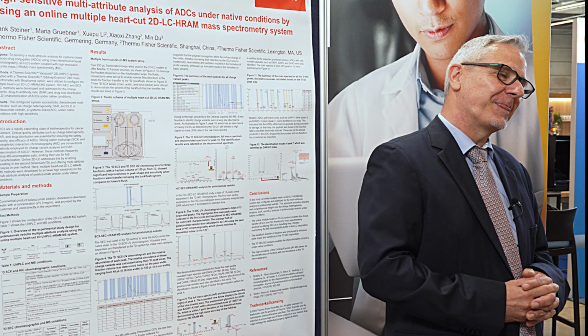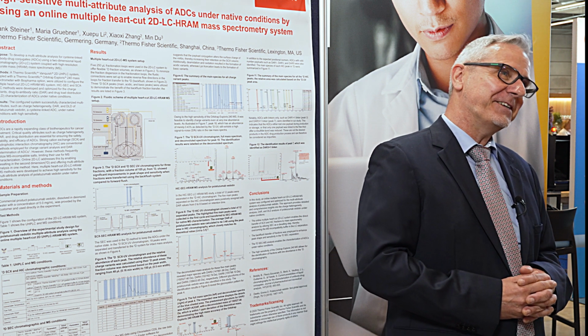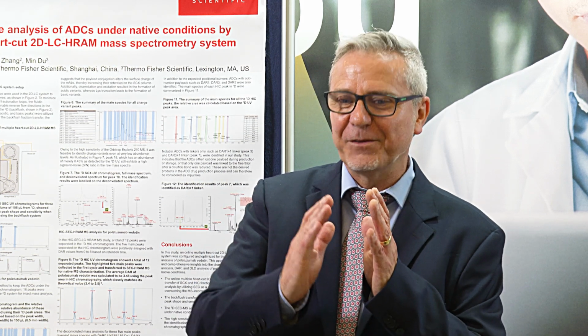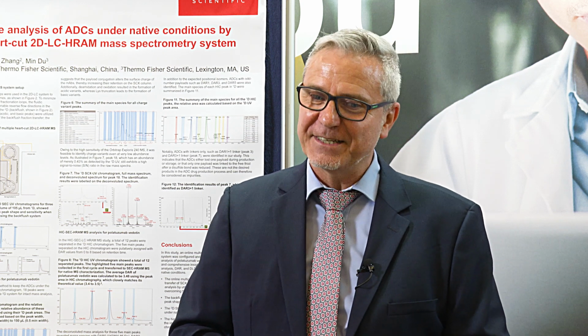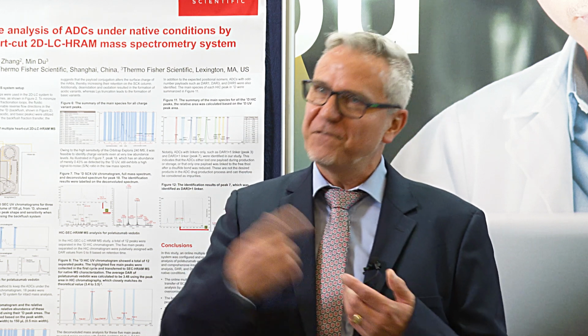Was there anything in your research that surprised you or stood out as a key insight? It was the extent of the challenges to get reasonable peak shapes in the second dimension, because a downside of size exclusion chromatography is you do not stack or focus anything on the second dimension column, and without that capability you have to be very careful what you transfer to the second dimension. So for instance, we have identified that it only works in a backflush mode. If you do a forward flush out of your fractionation loops, you mess up everything. That was kind of a surprising and important finding.